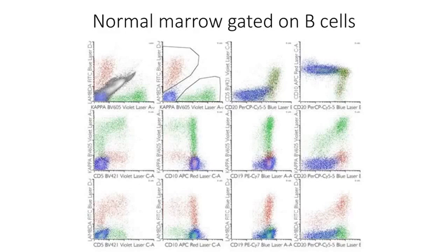We're starting out here with bright CD10 and no CD20, losing a little bit of CD10, acquiring CD20, and dropping down. Moreover, we can compare CD5 positive and negative, CD10 positive and negative with respect to light chain expression, and everywhere, no matter how we parse these B cells with the other antibodies, we're still getting a nice polytypic distribution. So it should be, in principle, very easy to find small clones that express any of these other antigens at different levels. Next slide, please.